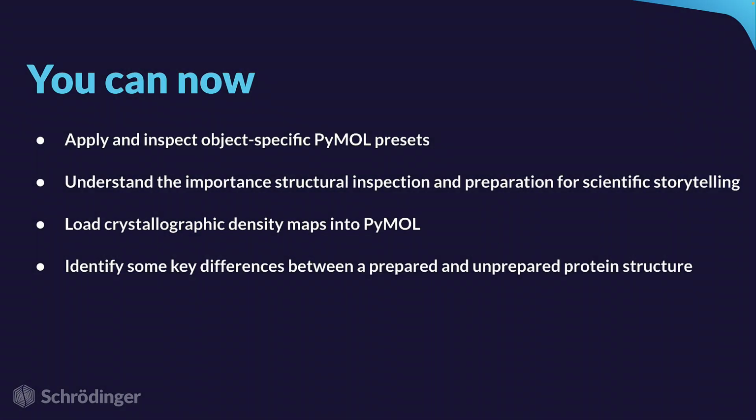That brings us to the end of this tutorial. You can now apply and inspect object-specific PyMOL presets, understand the importance of structural inspection and preparation for scientific storytelling, load crystallographic density maps into PyMOL, and identify some key differences between a prepared and unprepared protein structure.